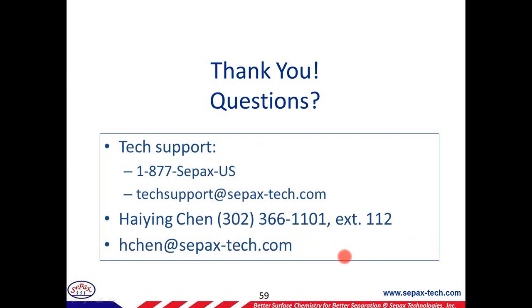All right, let me read it. Can you use ammonium as the cation exchanger instead of sodium or lithium? The answer is that an ammonium-based mobile phase is a very common choice for volatile mobile phases. We actually have some data showing the use of ammonium acetate or ammonium formate in the mobile phase, a lot of times as a volatile buffer for SCX or CEX for mass spec studies. So yes, you can.